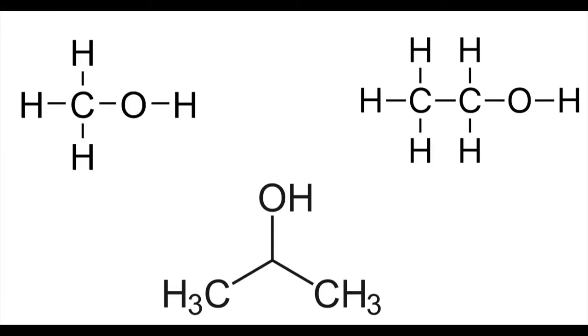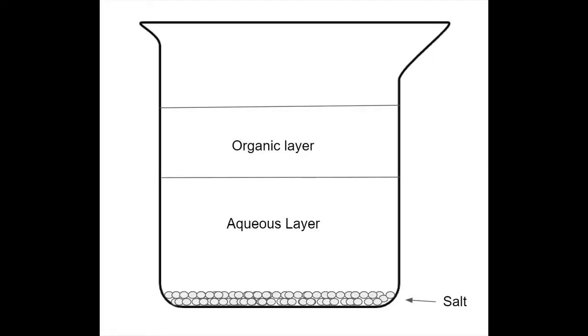Most, if not all, over-the-counter alcohols come with water present in them, which can be undesirable for certain reactions and procedures. One crude but very easy method of purification is to add table salt, which is largely insoluble in alcohols but soluble in the water that is present.